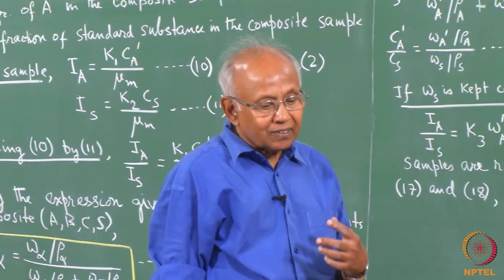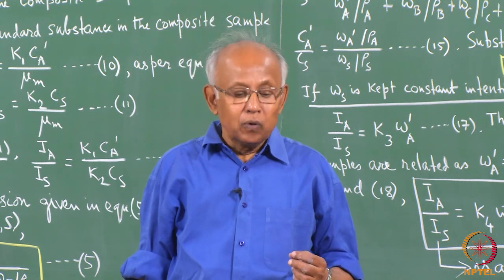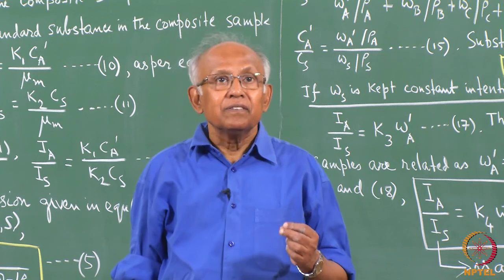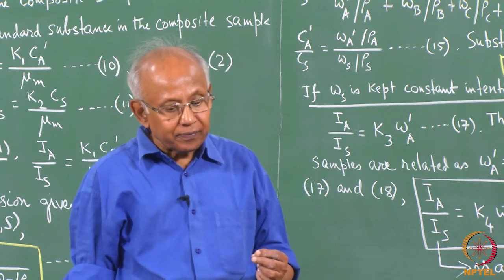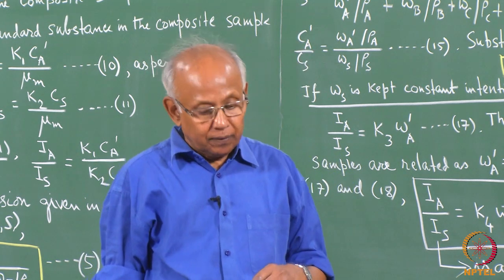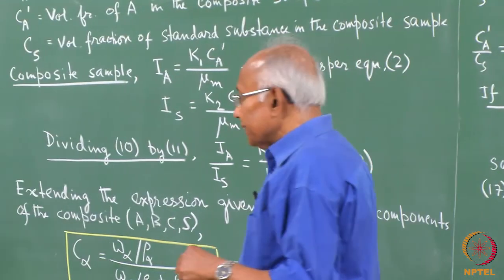So in the internal standard method, we mix a known amount of a standard phase, for which all the parameters are known, with the given sample and make a composite sample.